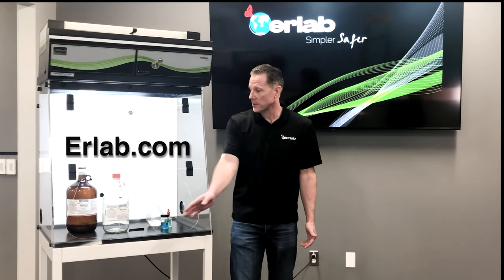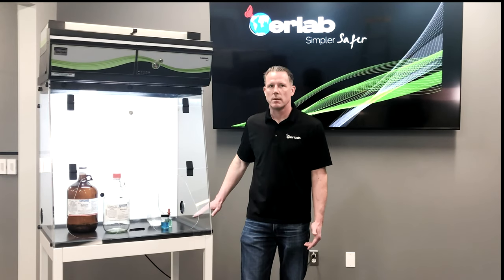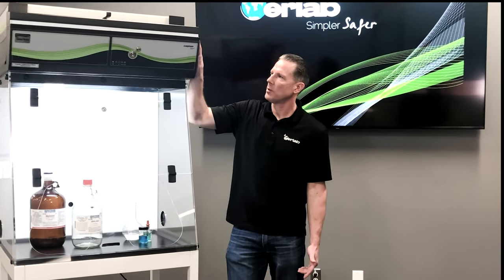This unit is approximately 31 inches wide by two feet deep. It has a filter based on your application, a fan box, and a control module with simple on-off controls. So, let's get started.